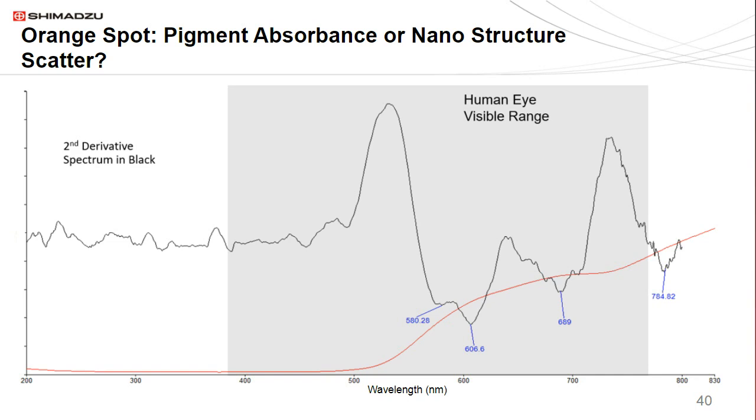Now, the original percent R looks like it could be the cutoff of a simple pigment. Most pigments function by simply cutting off at a certain wavelength. However, there is a hint of some peak structure within that would not necessarily be due to a pigment. So the second derivative pulls this out and shows us that there are 4 distinct peak structures there.